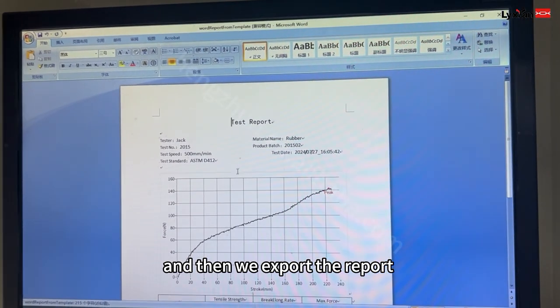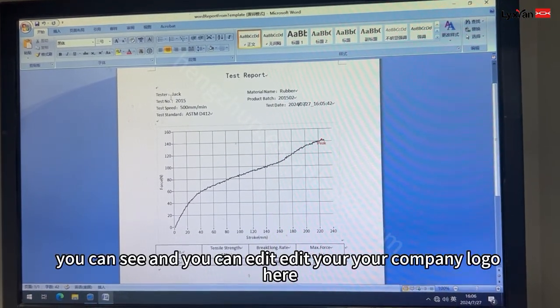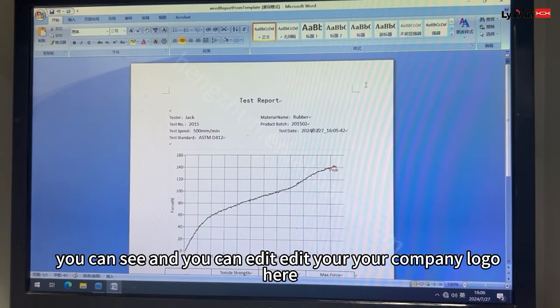And then we export the report — as you can see, you can edit your company logo here.